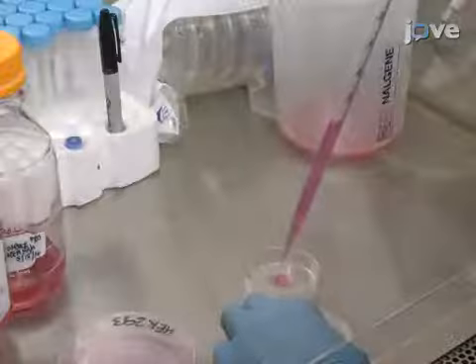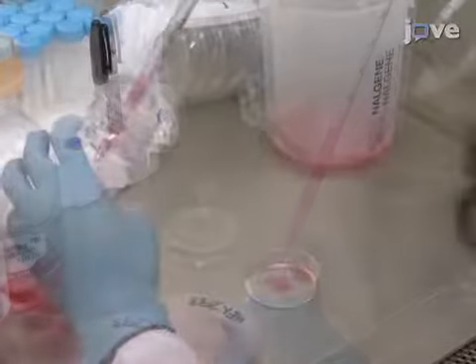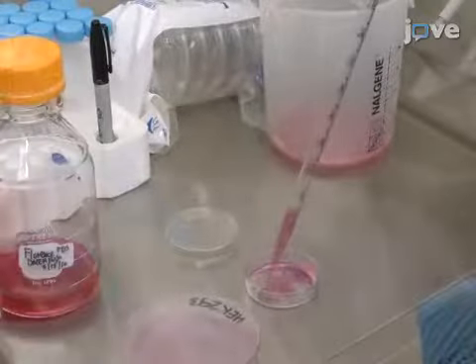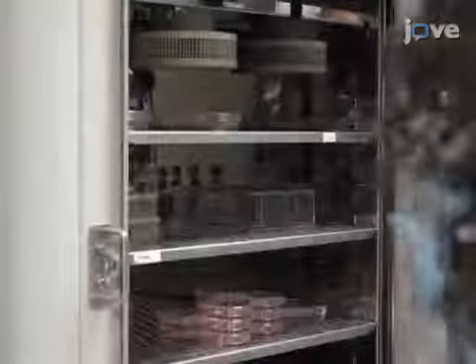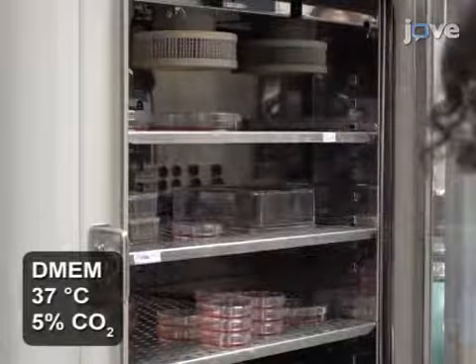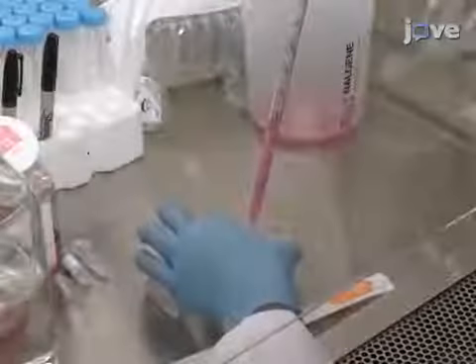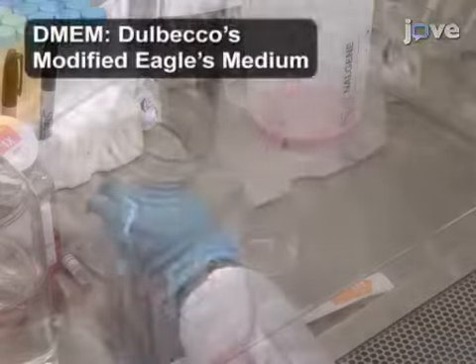To begin this experiment, seed HEK293 cells onto the sterilized glass microscope slides in the 6 cm dishes and culture for 1 to 2 days until they are about 70% confluent on the day of transfection. Next, empty DMEM from the dish and add 3 ml of the reduced serum medium. Then, add DNA transfection reagent.